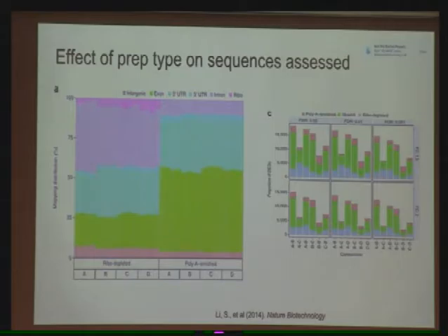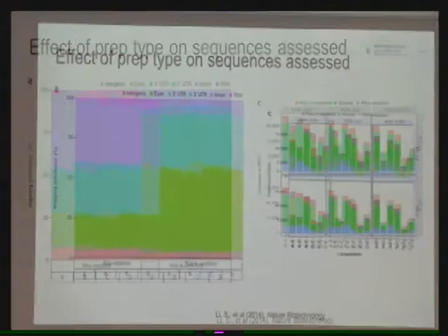And so it's something to keep in mind, because people will often say, this is my RNA-seq data set, and I sequenced it at 50 million reads. Well, that's good, but if you sequenced it at 50 million reads and you had really high alignment and a large fraction of them went to your protein coding genes, then 50 million is a reasonable number to say that you got pretty good quantitation. But if you had low alignment and only 25% of your reads went to exonic regions, then your effective depth is much lower than that. So your quantitation will be less accurate, is my point there.